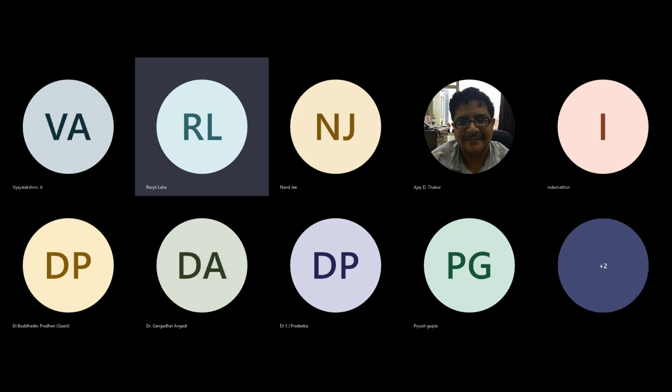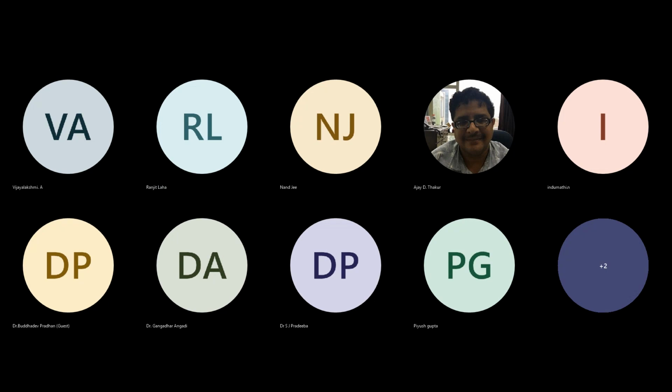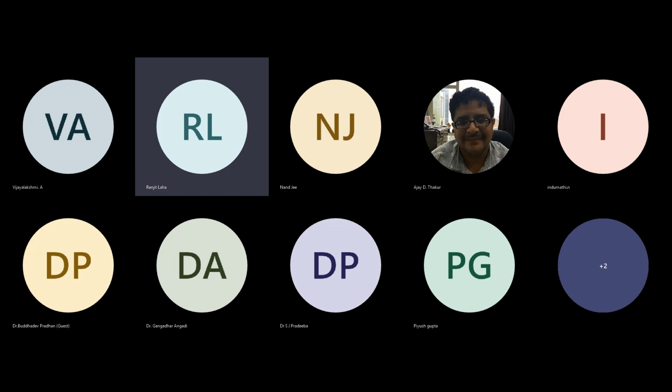So just to summarize, this facility is also accessible through the two site addresses I gave the other day. One is through our institute site, and the other one is through the iSTEM portal. iSTEM, just to recollect, stands for Indian Science and Technology Engineering facility mapping, basically for accessing all the facilities from anywhere in India.